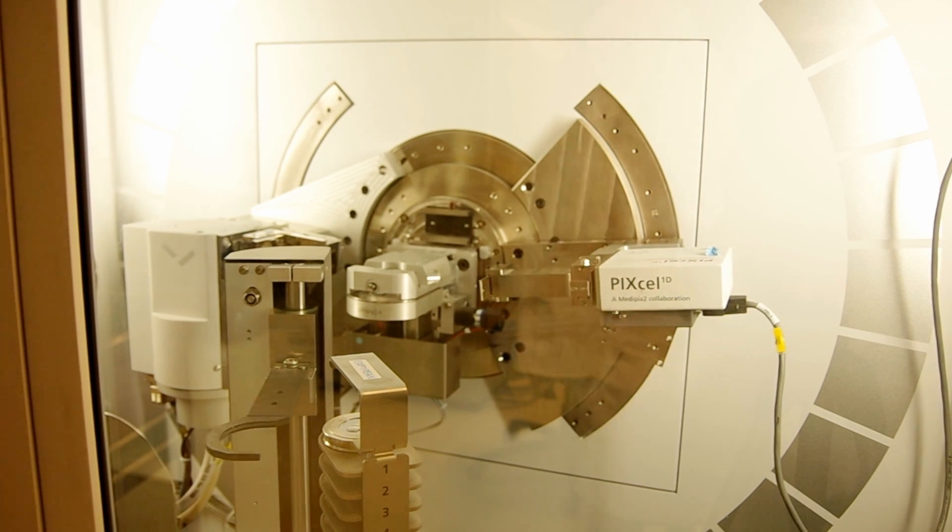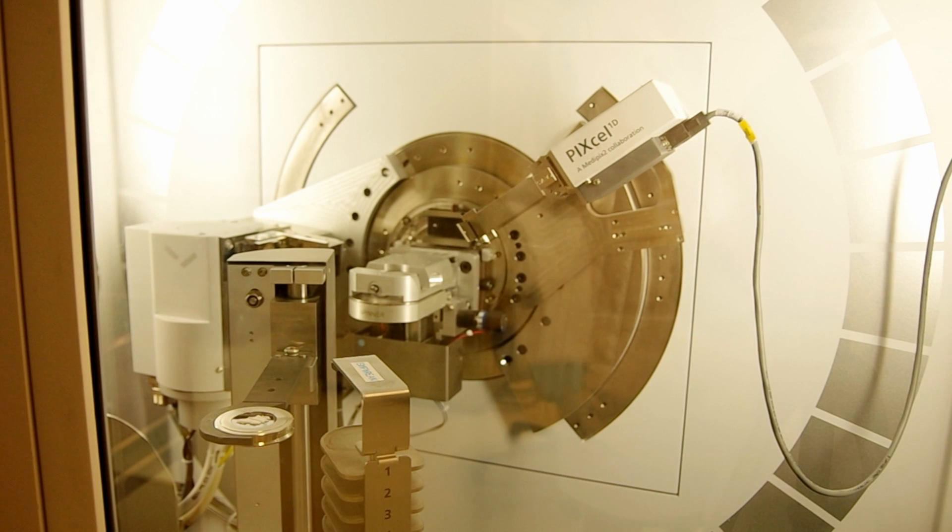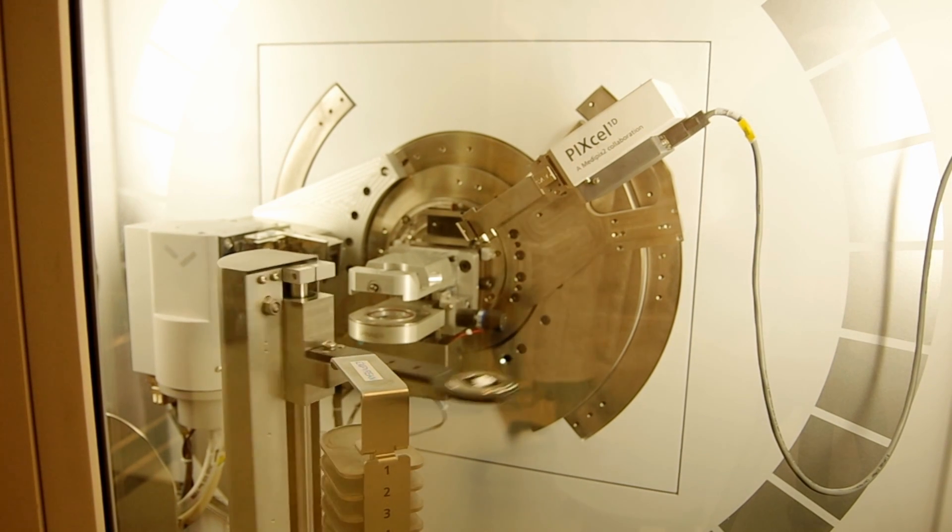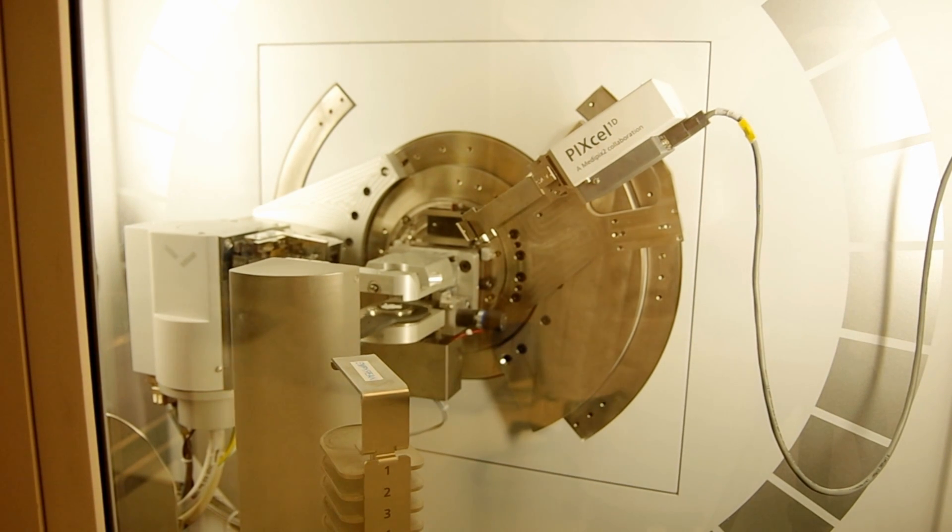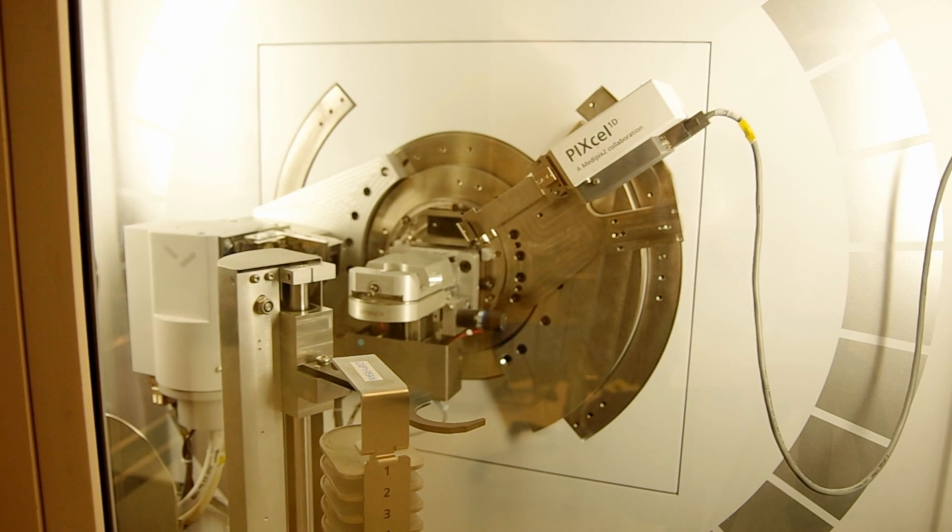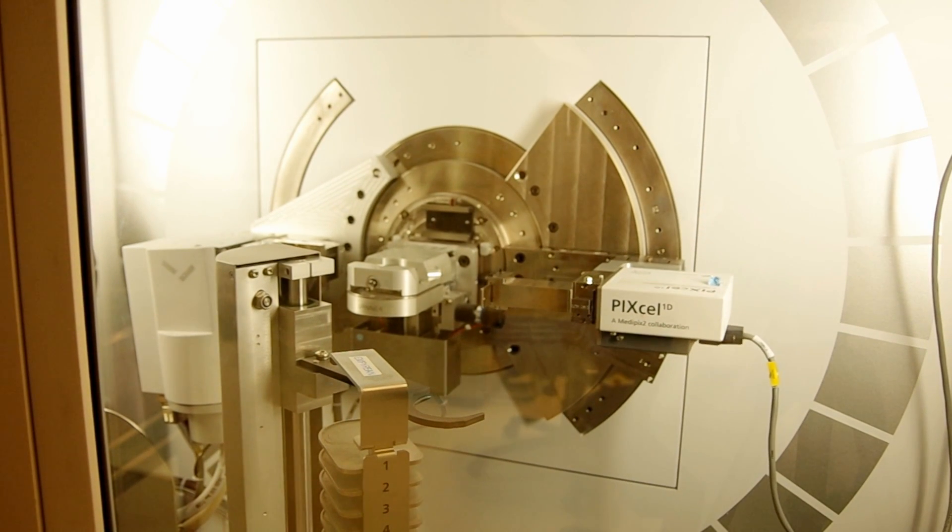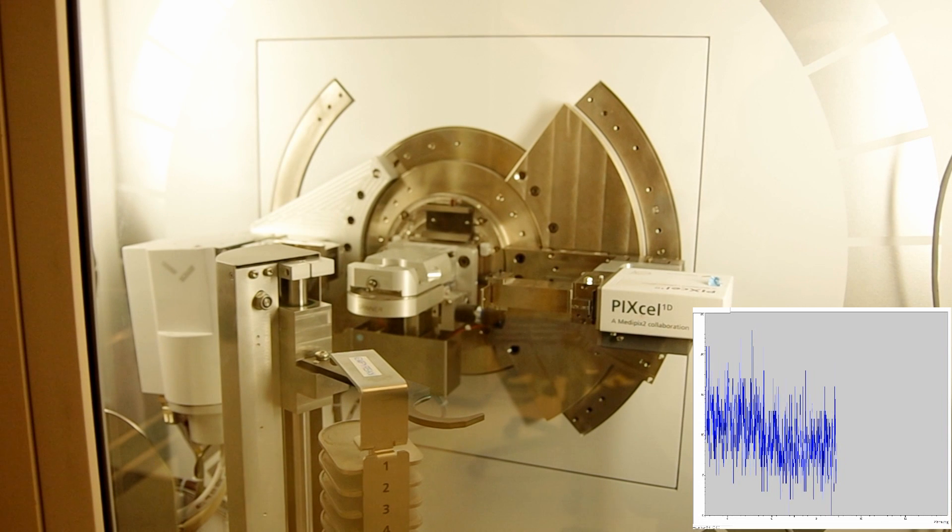The sample arm takes the sample from the sample holder and puts it on the platform. The detector then lowers itself down to the start angle to start the measurement.